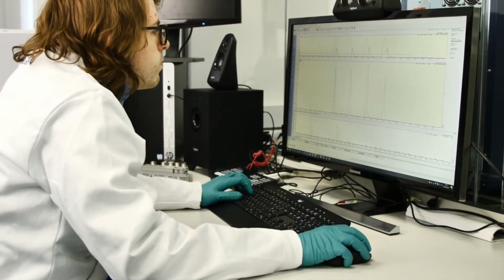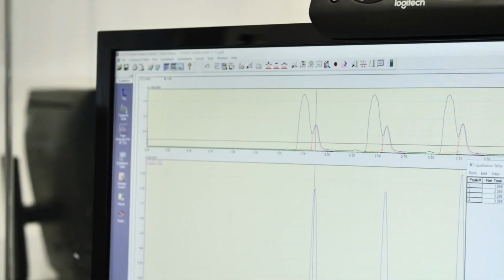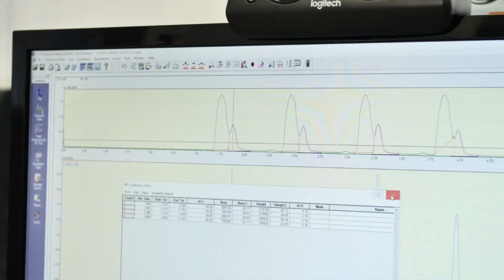A key thing to restate here is that mixture permeation isn't detailed in any of the industry standards. Here at Ansell, however, we like to develop our knowledge in permeation science, enabling us to go above and beyond the standards. As well as being able to test mixtures, we currently have a collaboration going with the University of Hull. This is through what is known as a KTP, a Knowledge Transfer Partnership. In this 3-year project, we're really trying to develop our mixture testing capabilities and really understand how mixture permeation works. This will enable us to perform informed estimations and develop models for the millions of mixtures that no one will be able to ever test.